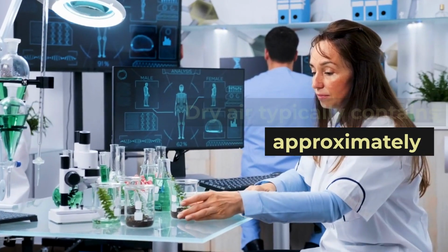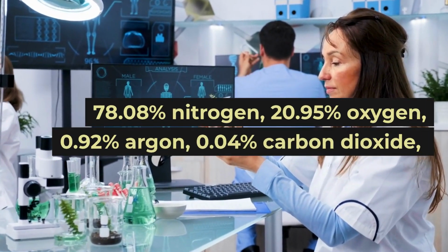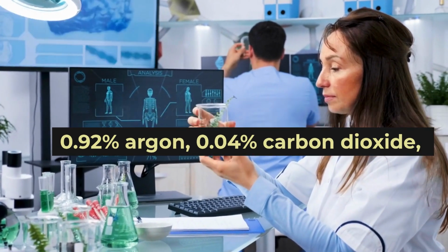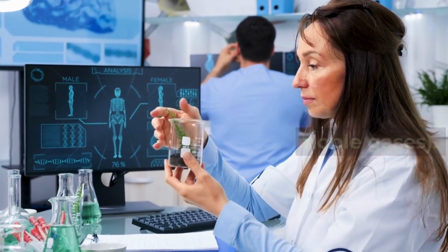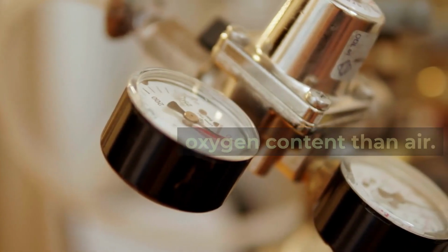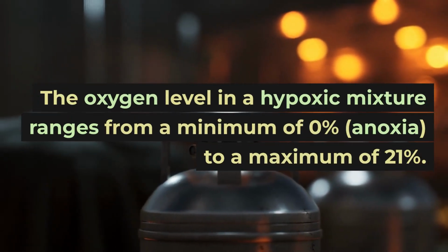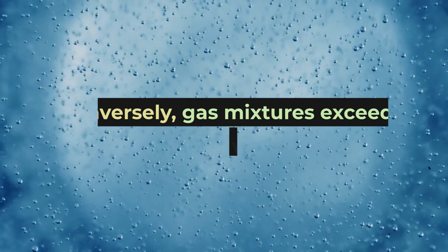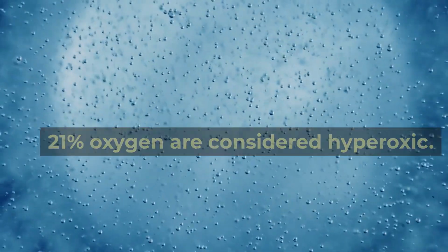Dry air typically contains approximately 78.08% nitrogen, 20.95% oxygen, 0.92% argon, 0.04% carbon dioxide, and other trace components, largely noble gases. A hypoxic gas mixture has a lower oxygen content than air. The oxygen level in a hypoxic mixture ranges from a minimum of 0%, anoxia, to a maximum of 21%. Conversely, gas mixtures exceeding 21% oxygen are considered hyperoxic.